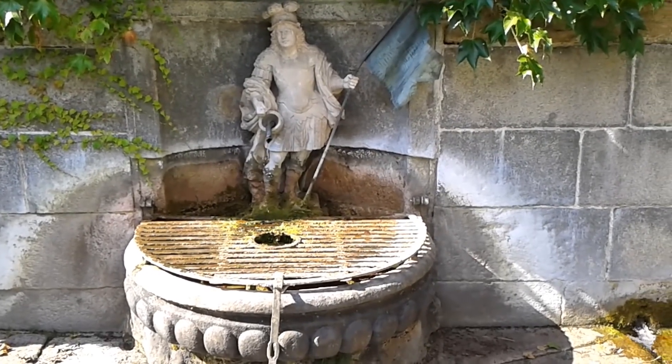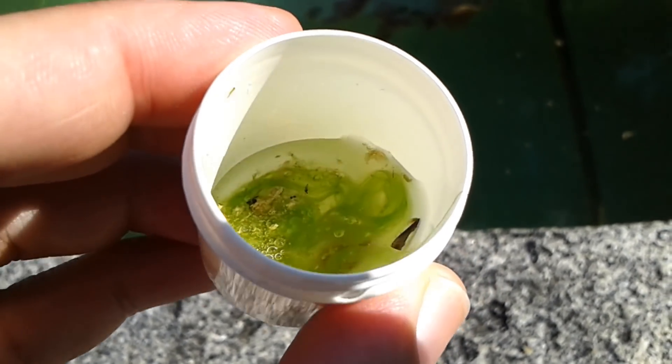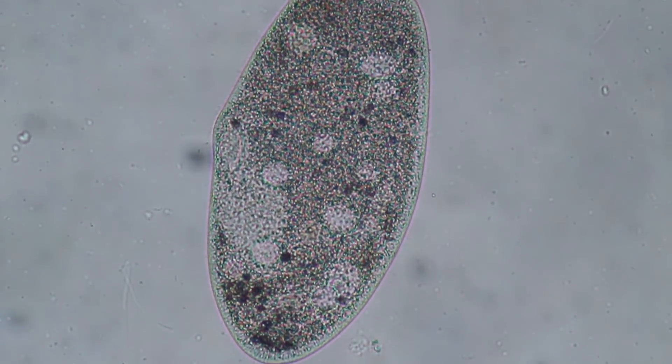Summertime, sun is shining, temperature is warm, and I'm visiting again my little water fountain — plenty of algae, and of course also plenty of other Paramecia and other little water organisms. And here we've already got one.